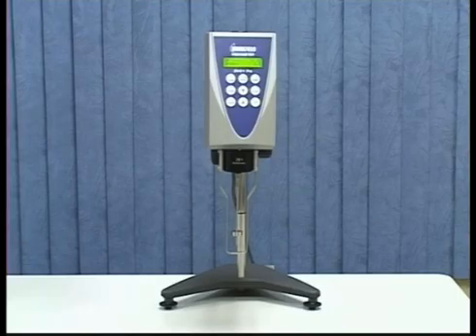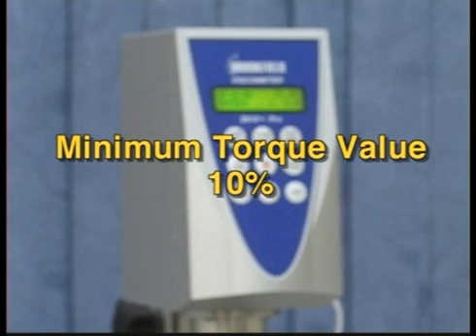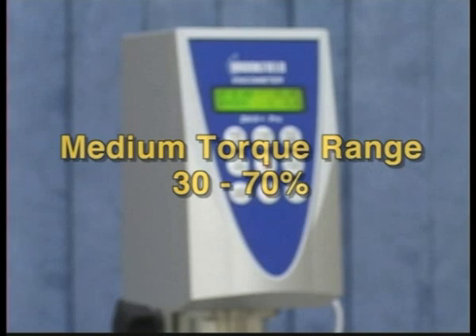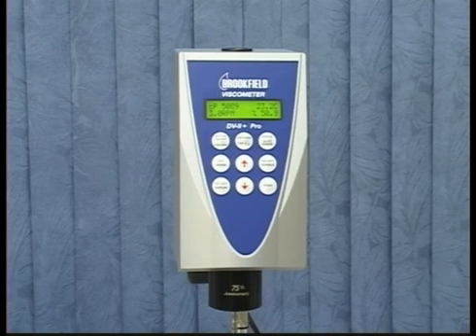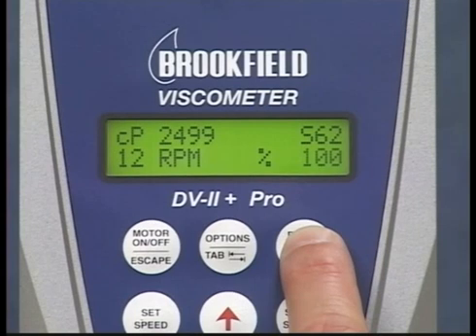Based on the spindle you will be using, select three speeds that will give you a low, medium, and high torque value. The minimum torque value for a good reading is 10%. A low torque range would be 10% to 30%, a medium range 30% to 70%, and a high torque range above 70%. This will check the linearity of the spring on this instrument through its full range. With the digital instrument, you can easily find the full scale range by turning on the motor and pressing and holding the auto range button.